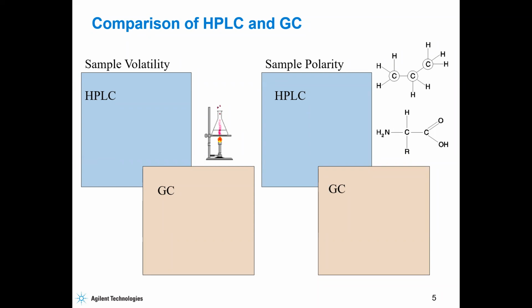And now if you look at any journal where they've used HPLC or GC, the scientists will tell you the name of the column, the length of the column, even the internal diameter of the column, the thickness of the stationary phase, the temperature, so that if you see a journal that you want to replicate, you have to follow the precise conditions that the author has used.